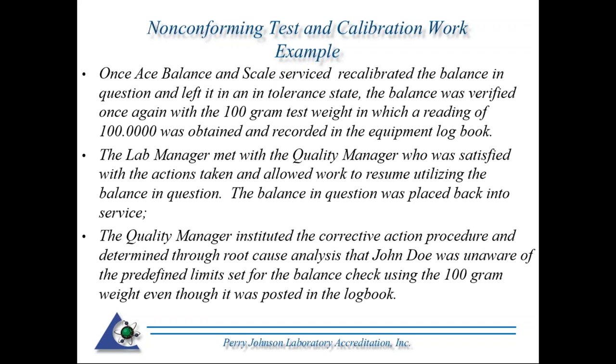So hence, the corrective action procedure was determined through a root cause analysis that John Doe was unaware of the predefined limits set for the balances using the 100-gram weight, even though they were posted on the logbook. So in other words, we're going to find out what the root cause of the issue was. John Doe is stating he was unaware of the predefined limits. However, they were clearly posted within proximity of that logbook.